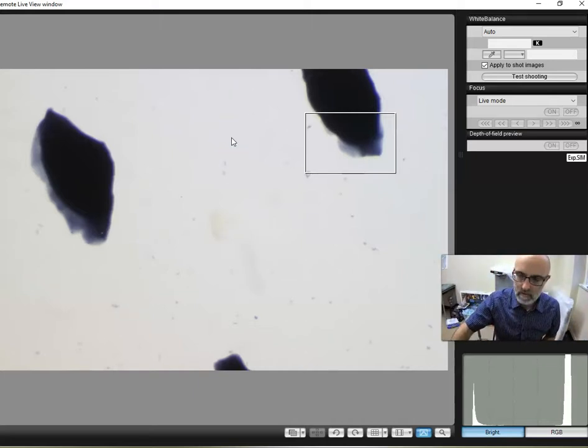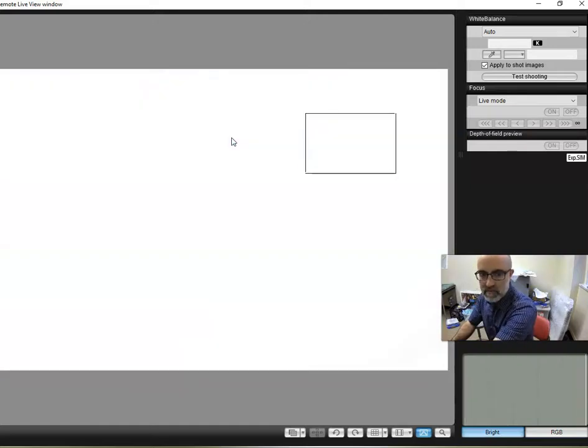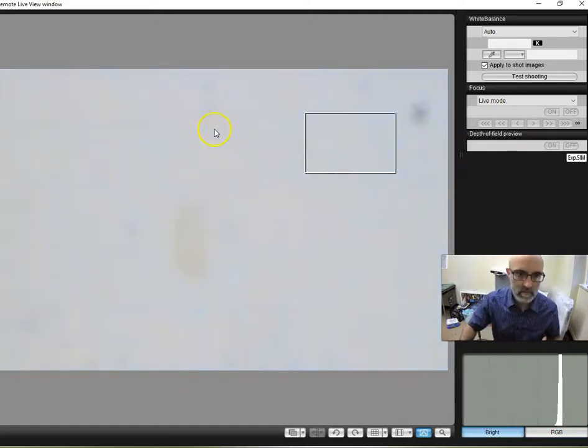Adjust the focus. And then we're going to go to higher magnification. So you can kind of see the specimen in the background here. We're going to use the fine tune and focus in. There he is. There's our little tardigrade guy. Okay. Now, its orientation is wrong. It's pointing straight up and down. This would be the front end. This would be the back end.